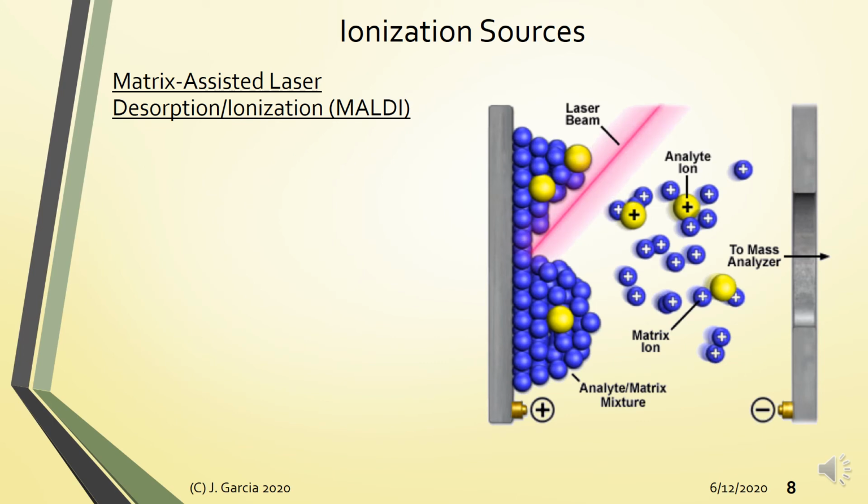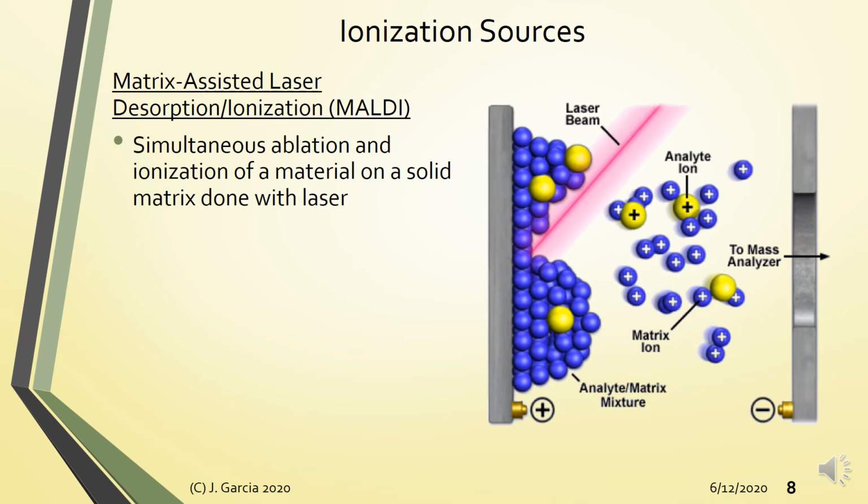Next, we have your matrix-assisted laser desorption ionization, abbreviated as MALDI. Here, we mix your analyte molecule, which is usually a large analyte molecule, with a smaller matrix molecule. An example of this matrix molecule could be hydroxypicolinic acid.